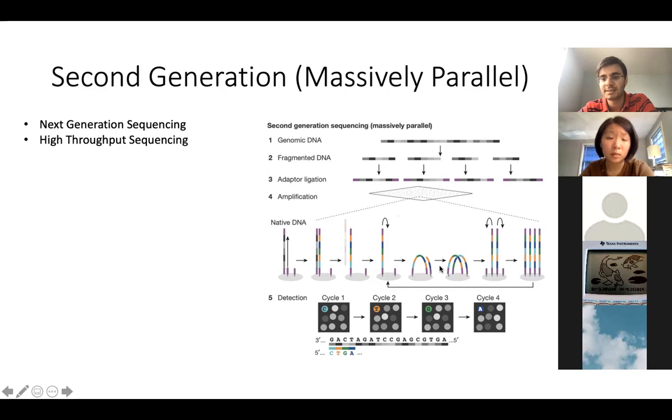So in each cluster, we are reading one sequence. That's why it's called massively parallel or high throughput sequencing. And the word parallel here really means parallel, because this one cluster is parallel to this, which is parallel to this, which means that in the flow cell, they are side by side. They are parallelly distributed, if that makes any sense. Okay, questions or comments here?